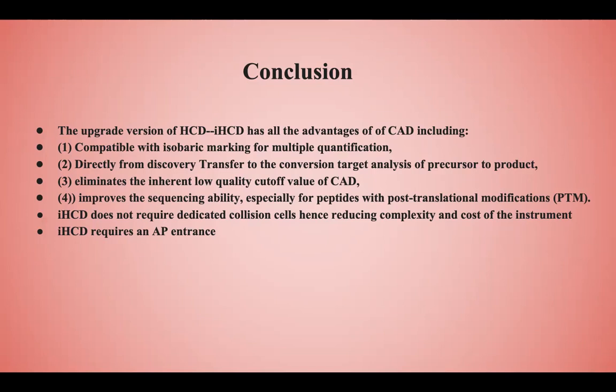IHCD eliminated the need for a dedicated collision cell, thereby reducing the complexity and cost of the instrument. To conclude, IHCD is an effective and easy to implement technology.